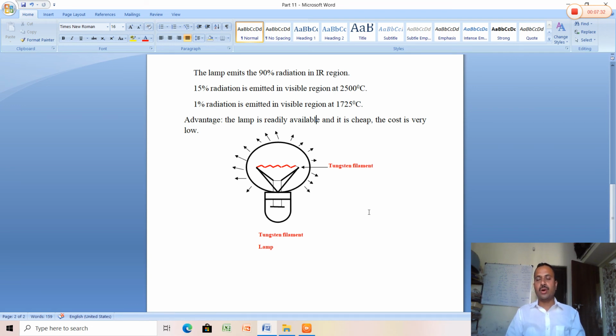We covered how the voltage is kept constant, the construction and principle of the tungsten filament lamp, its drawbacks associated with the infrared region, and its advantages. This video deals with this part.